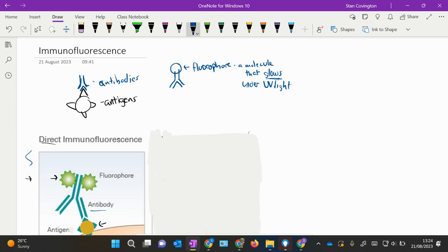Now, you've already probably, or somebody looked at fluorescence, and that's the idea of tagging things. This is a bit more specific, and we'll get into the differences later. So it comes down to the basics of, right, antibodies will target specific antigens, okay? So this is used in your immune system. This is how you fight off infections and things.